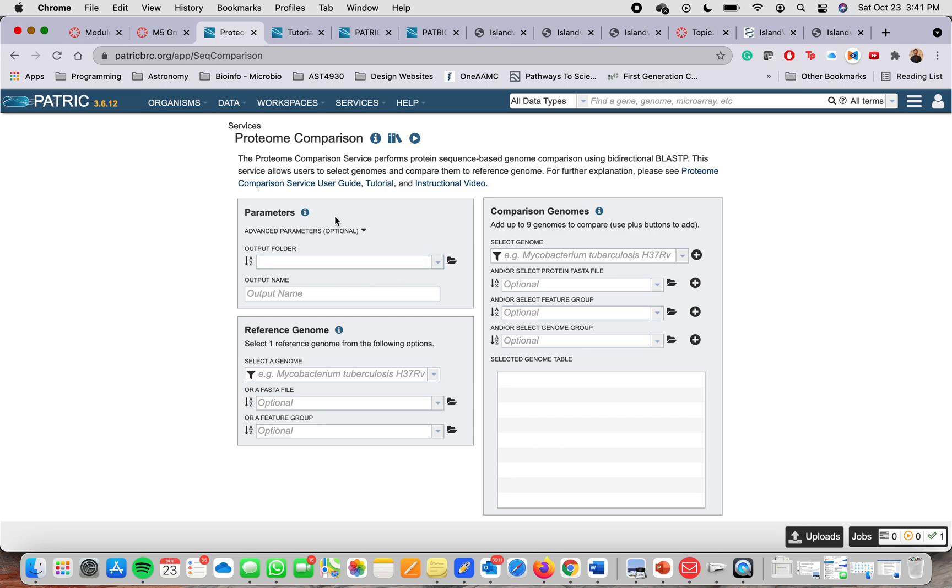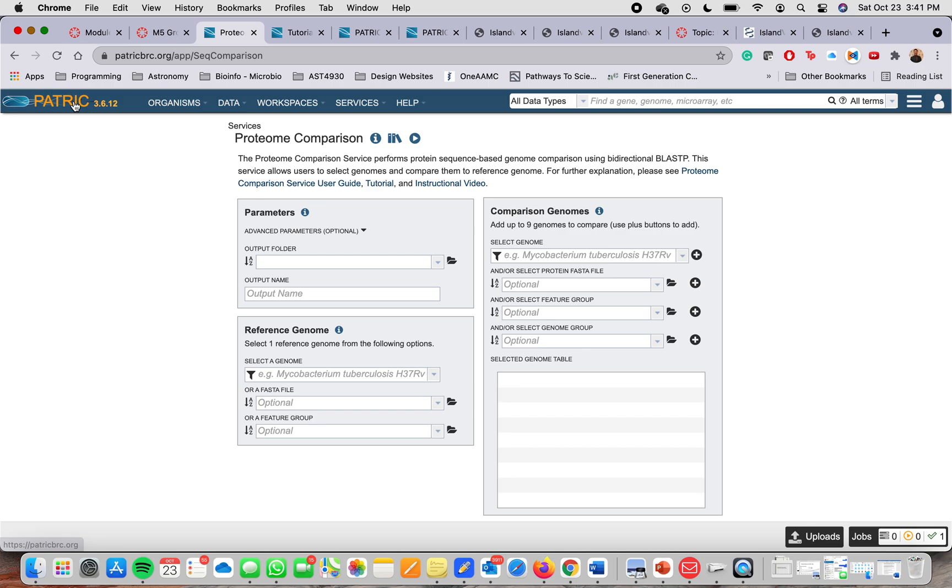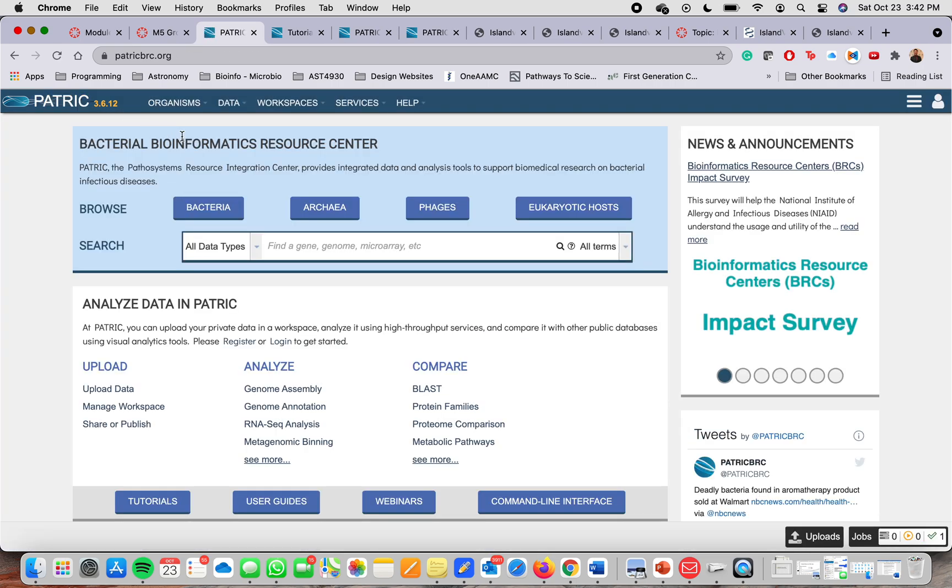And if you're confused or anything, you can see the tutorial. Let me see where I found the tutorial for this. Here you go. Okay. This is the main website and the main website.